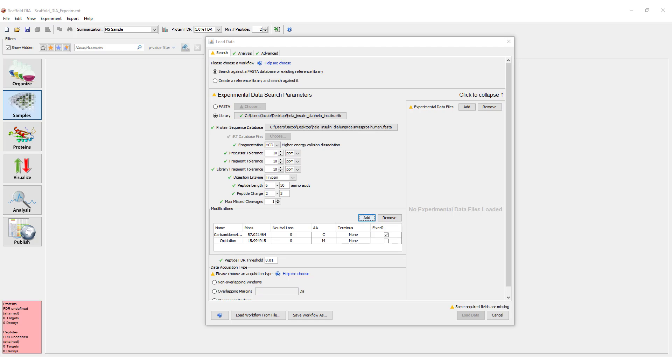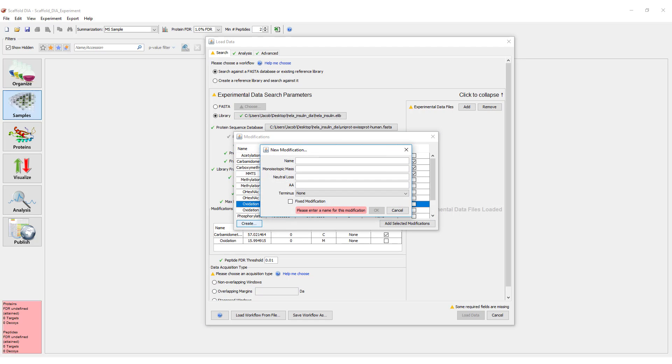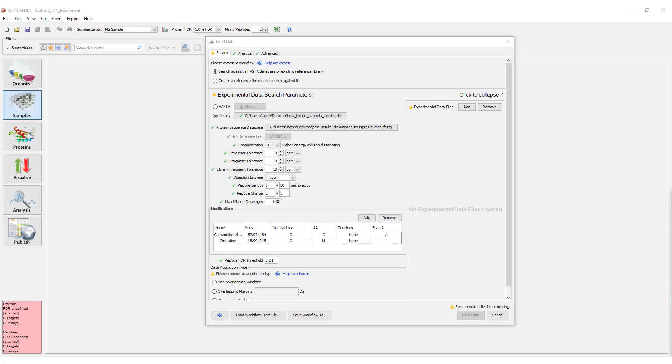Users can also create a modification that is not listed using the Create button. This will bring up a dialog where the modification can be defined.